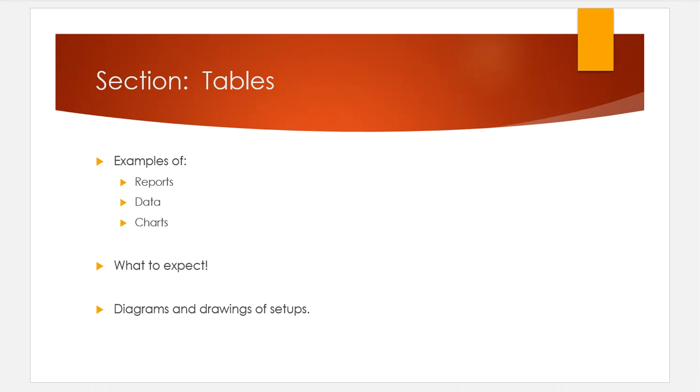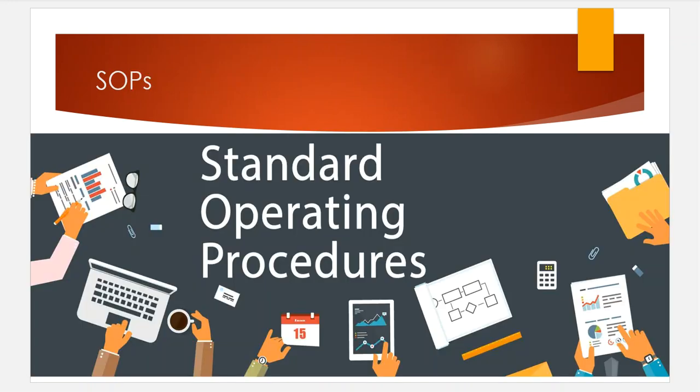All right. So that is going to stop our method discussion. And after this, we're going to dive a little bit deeper into what we call a standard operating procedure or an SOP. So now that we have this idea of where the SOPs originate from, the methods are coming from these regulatory agencies. I need to look at those, see what's there. Now we need to take that and actually customize it for what we do in our own lab facility. Are there any things that we need to talk about as far as SOP is concerned that we need to highlight and that we need to mention? So that's what we're going to do in the next portion of the lecture video series.